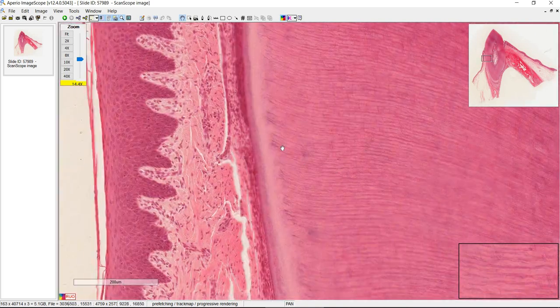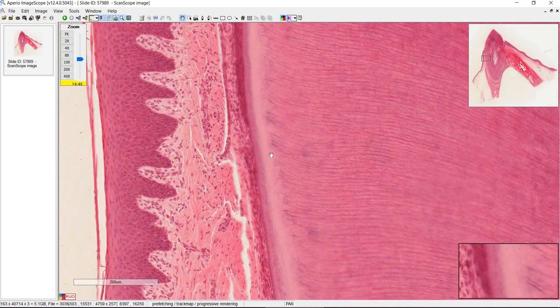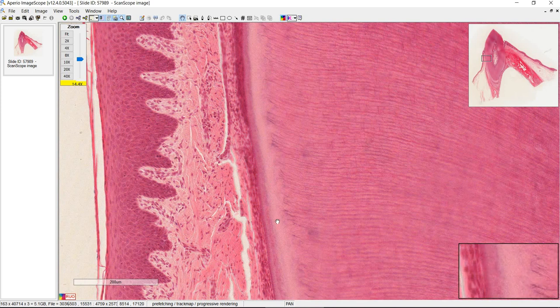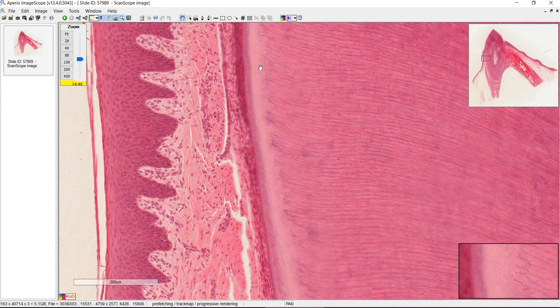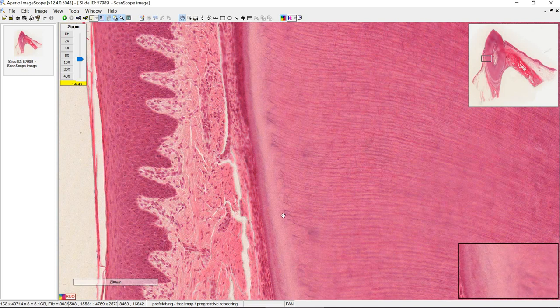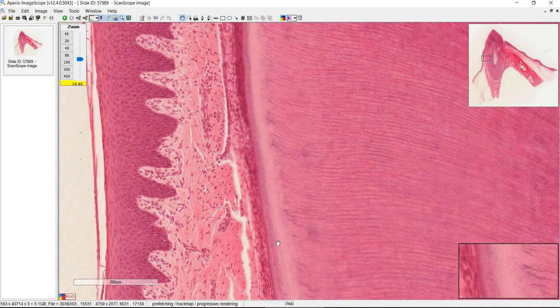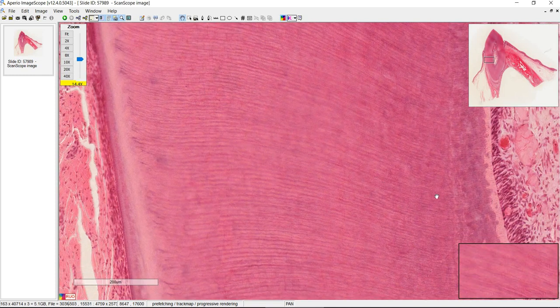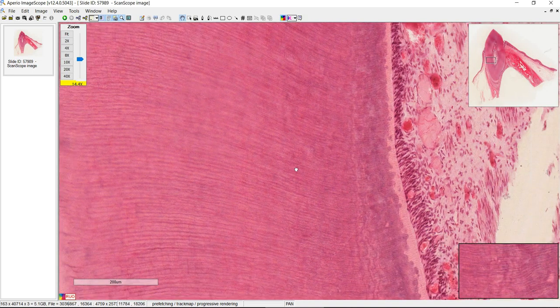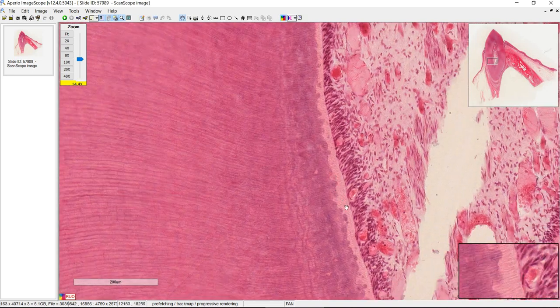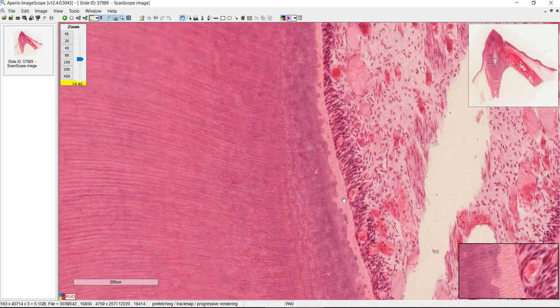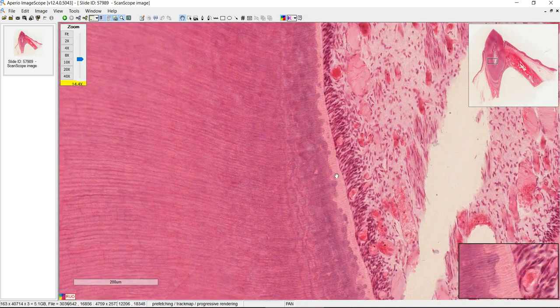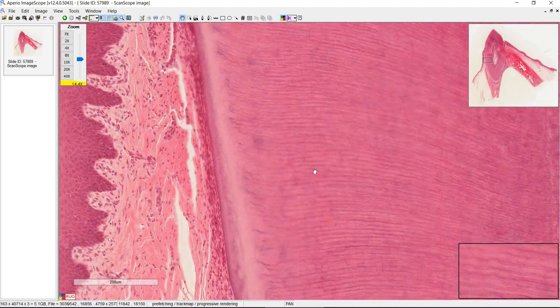If we go further out, this lighter staining area here is also dentin but I don't think this has any significance really. This is not pre-dentin. So if you're calling something pre-dentin it has to be right by the odontoblasts.